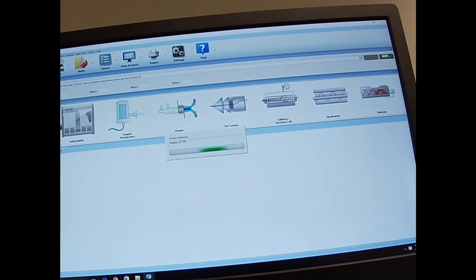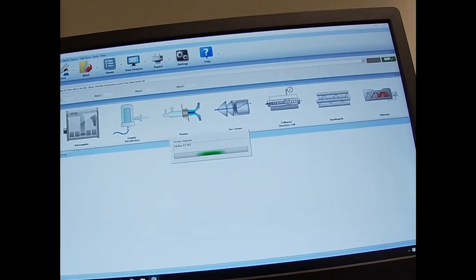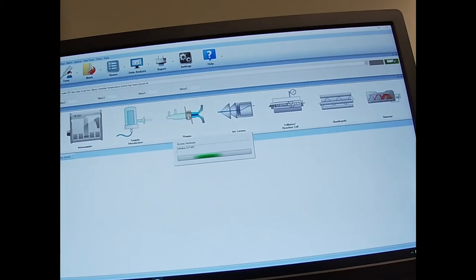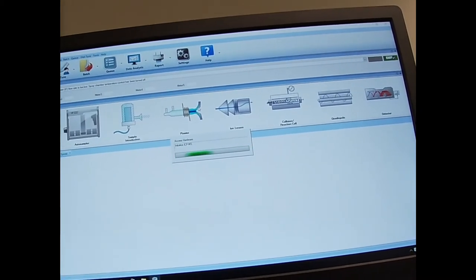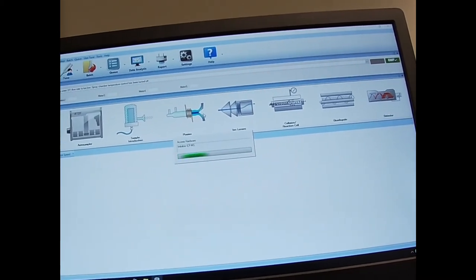We have our argon inputs. The torch is formed here. The coils, these are RF coils. They actually maintain our plasma and this is actually representing our skimmer cone.